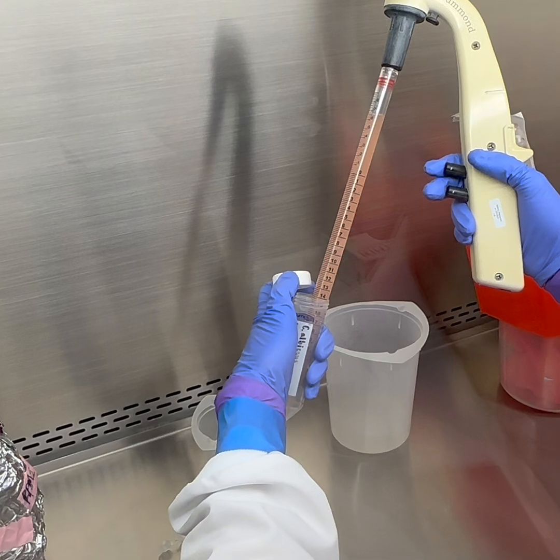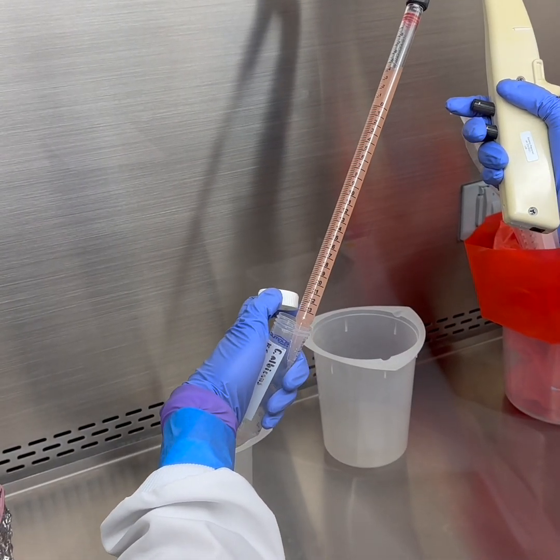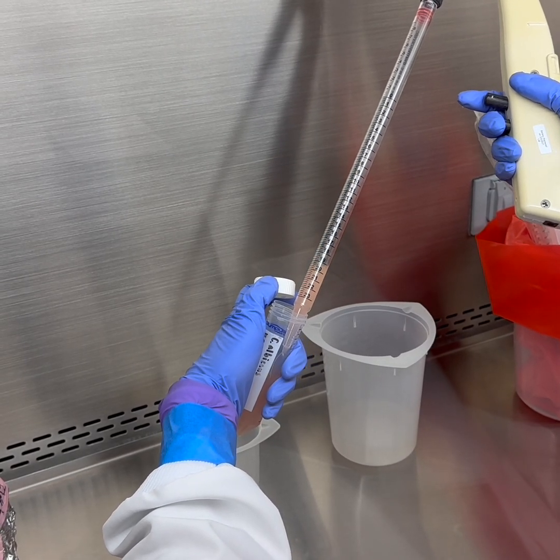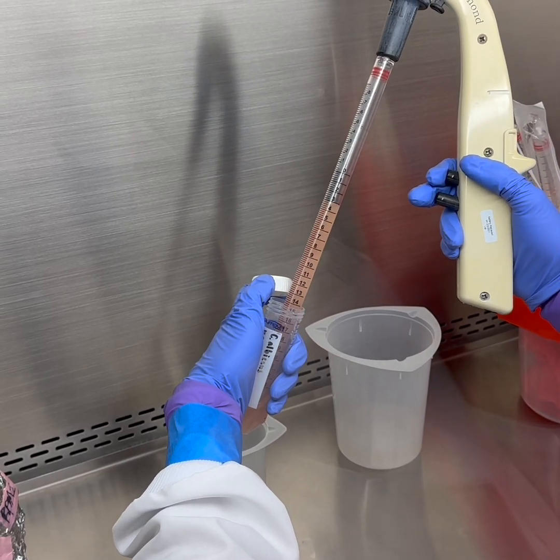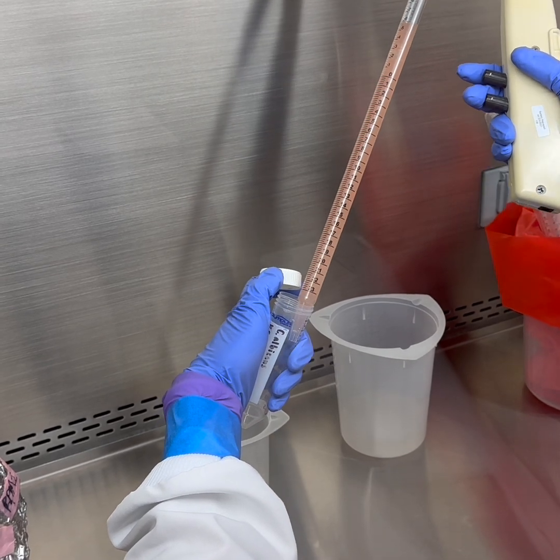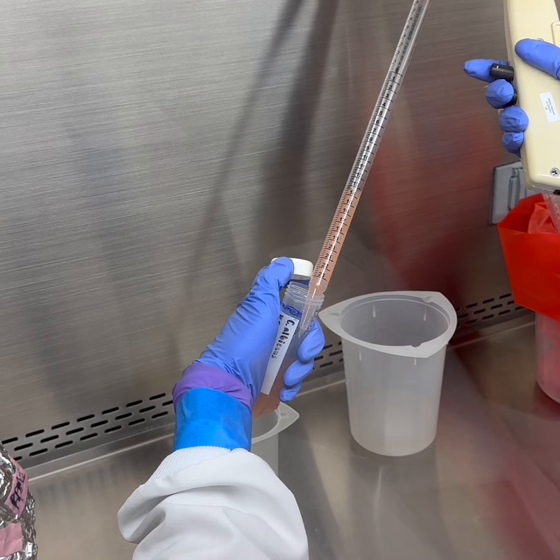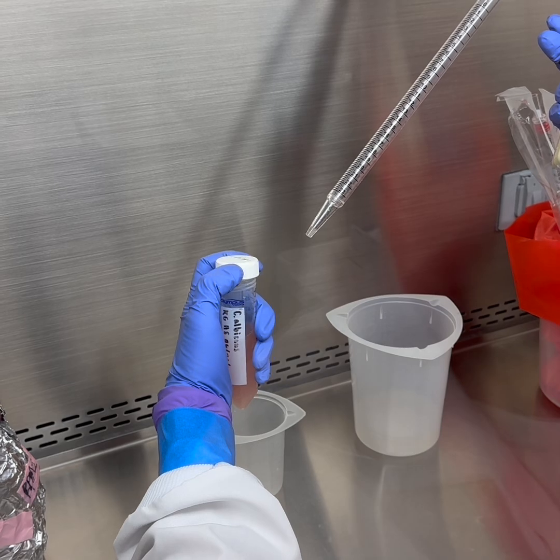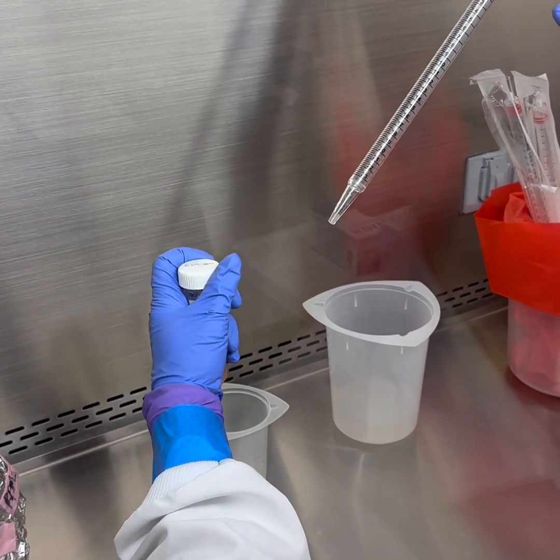Careful not to pull any into the pipette. You see I'm kind of getting up there. All right, I don't see any specks, but I'll do it one more time just to make sure. Okay, no specks. I'm just going to take a little bit. You see how there's some left in the tip, and that's going to be our aliquot.